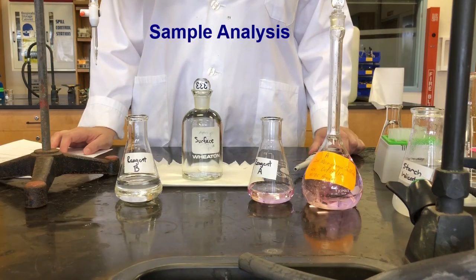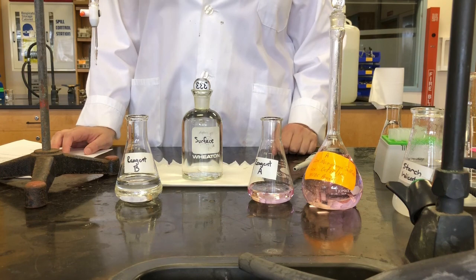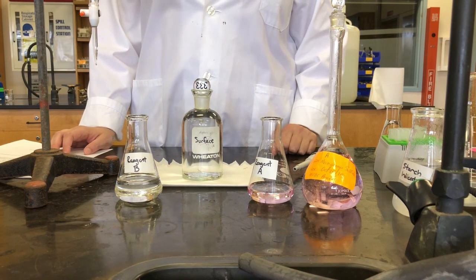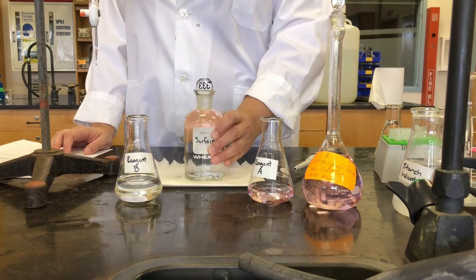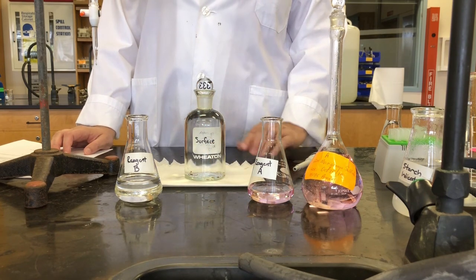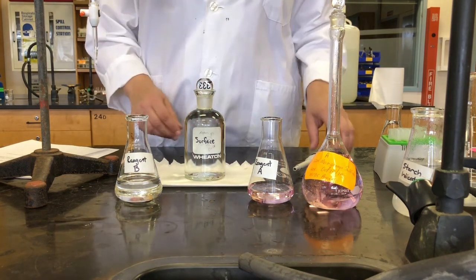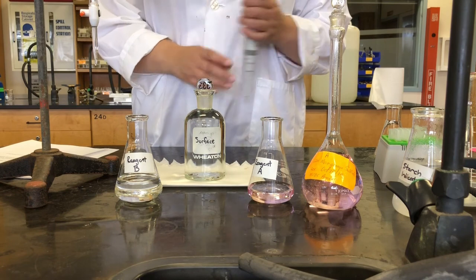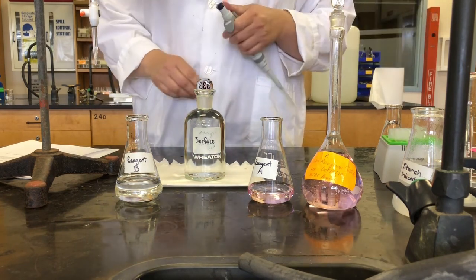Okay, so now we're going to move on to our samples. So this is a sample of water from Kent's Pond, and it's a surface water sample. So we just took the bottle and let the water pour into it from the surface of the lake so that we get the water that's at the top, okay? So first thing we want to do is fix our sample so that we can analyze it when we are ready. So this is a step where we actually add the manganese.